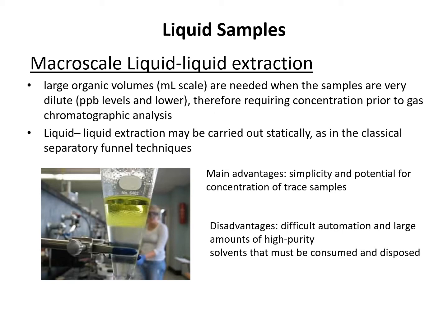This extraction is carried out as shown in the figure here, the very classical way using the separating funnel technique.